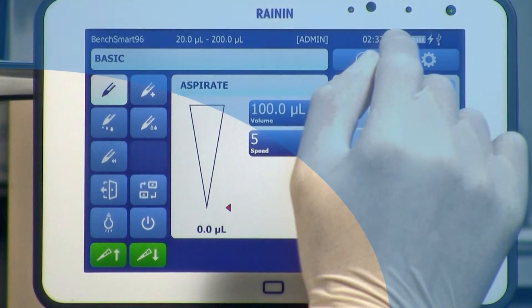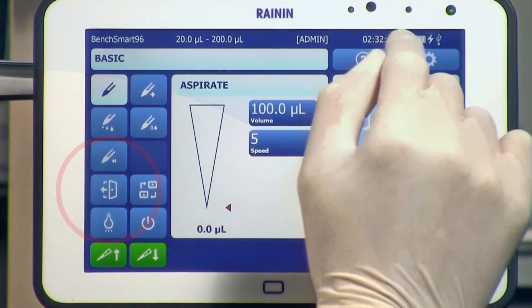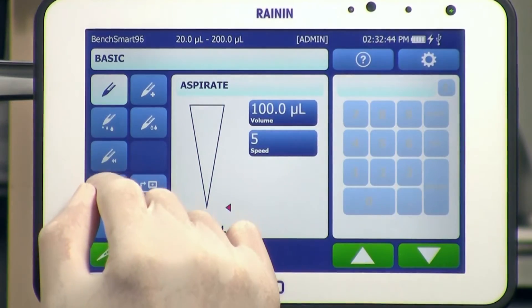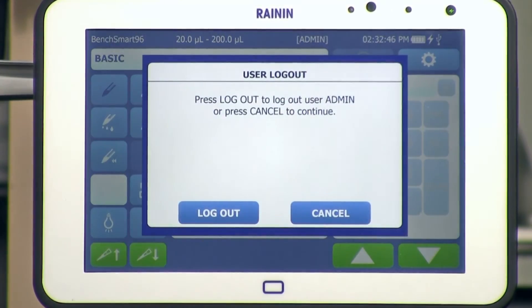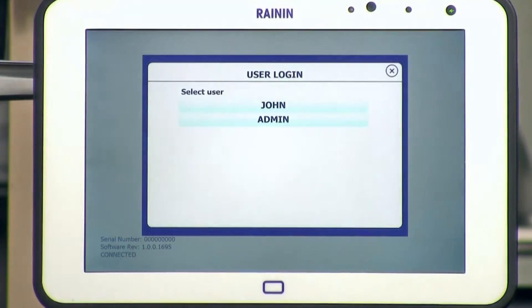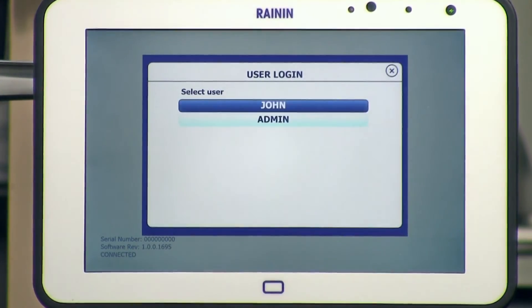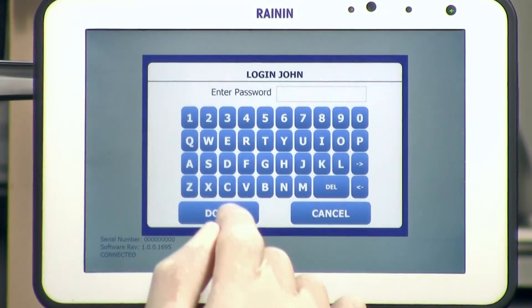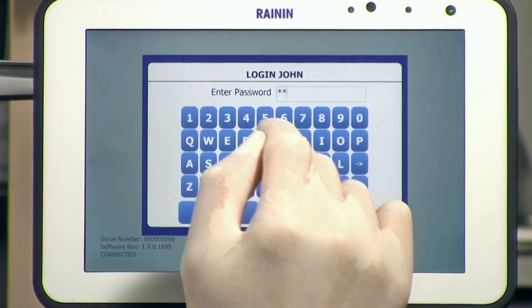To log out, tap the Logout icon on the left of the tablet home screen — it's a door with an arrow — then tap Logout. You can log back in again on the user login screen, which you'll see any time you start up BenchSmart.